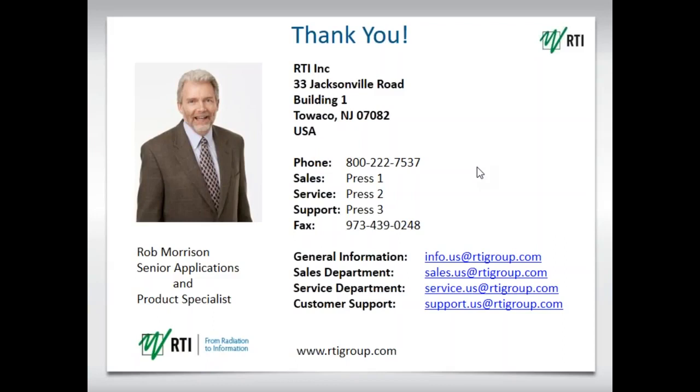Great. I really like this next question. Is Ocean Professional software updated? And if so, how often do the updates come out? The Ocean Professional software is typically, and I'll say typically, this is our norm, we like to give 2 releases a year, one around the June time frame and one around the December time frame.